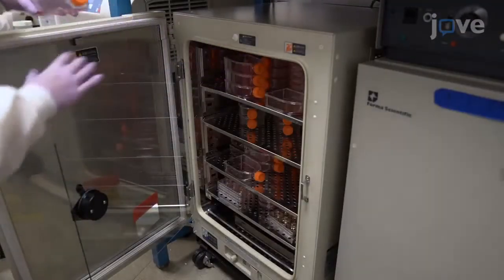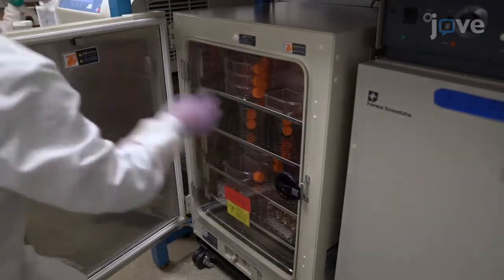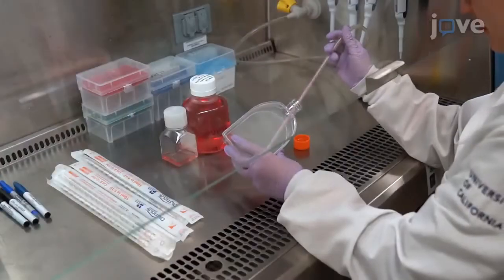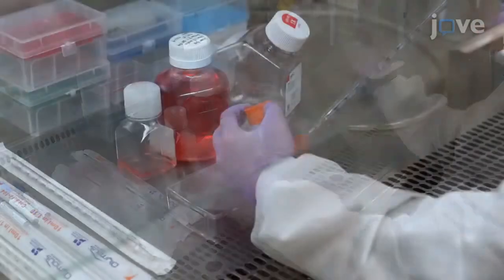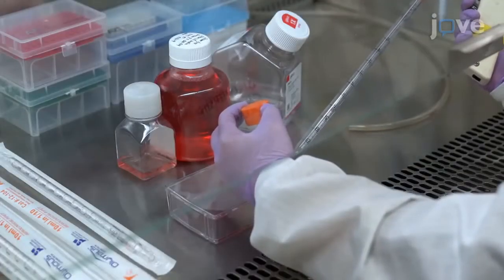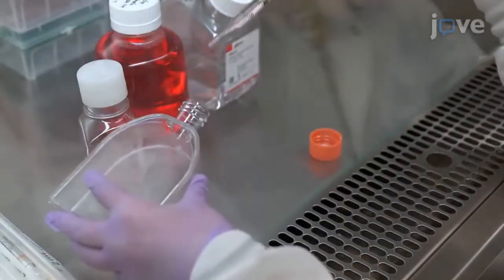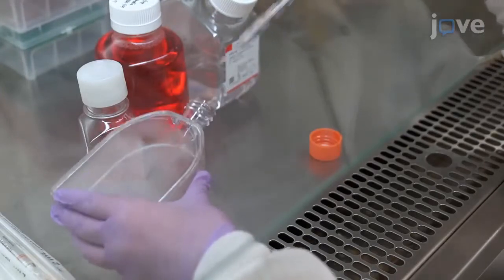Retrieve the tumor cell and transfer it into the tissue culture hood. Aspirate the medium and wash the cells with 10ml of PBS. Then add 2ml of cell detachment solution to the flask.